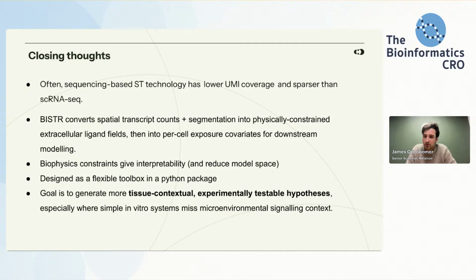So this tool that we developed, BISTR, converts spatial transcriptomics counts, in coordination with segmentation, into physically constrained extracellular ligand fields, and then into per cell exposure for downstream modeling of the effect of ligand exposure on gene expression. And we believe that modeling ligand receptor interactions like this with biophysics constraints gives more interpretability into the intercellular signaling process.